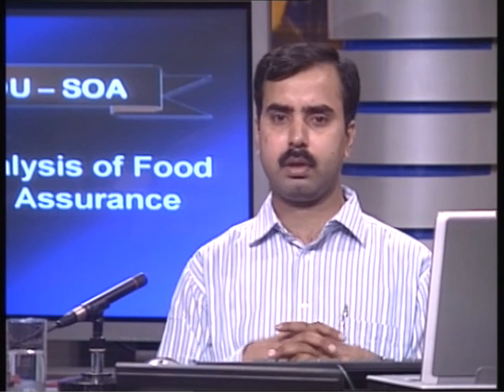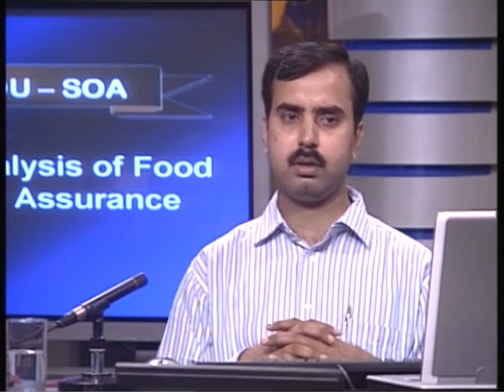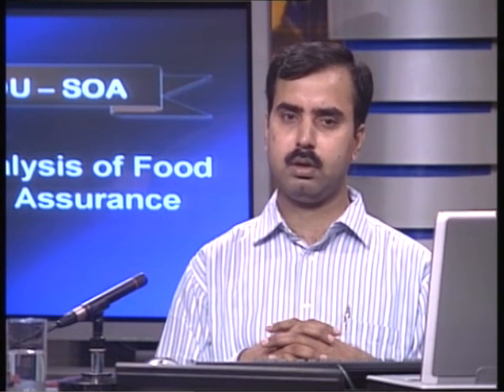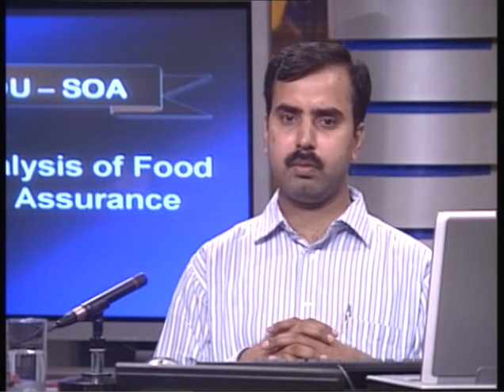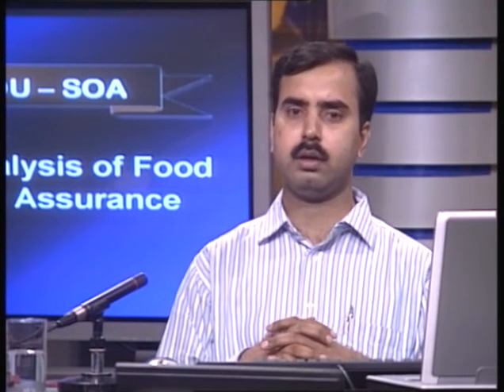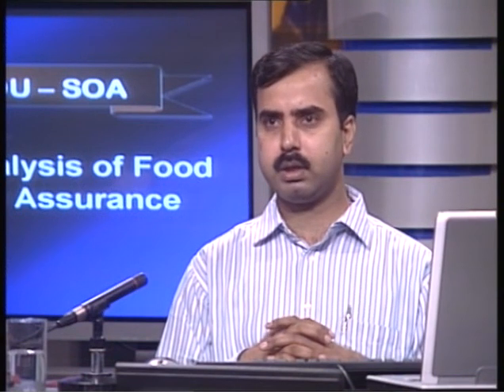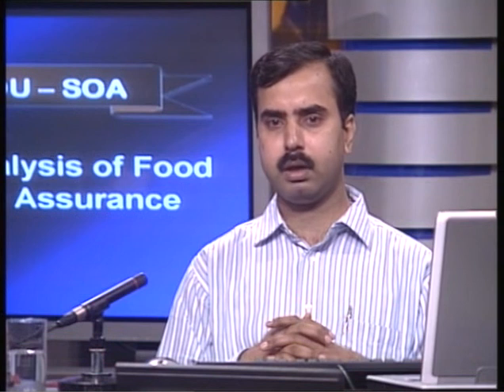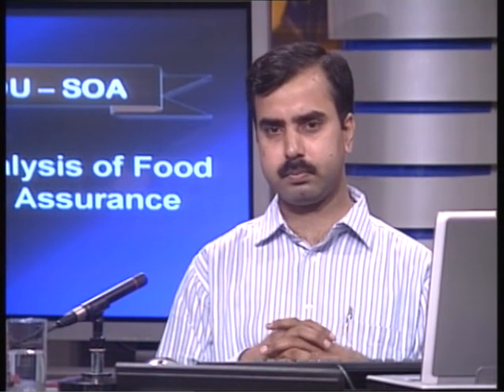The detector will detect the analytes in the same order, which is coming first and which is coming later. So based on the detection in the detector, we get the retention time of a particular analyte. Retention time is nothing but the time taken by an analyte to travel from the column to the detector.